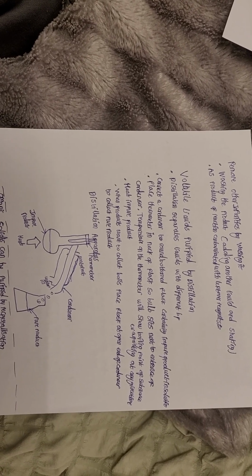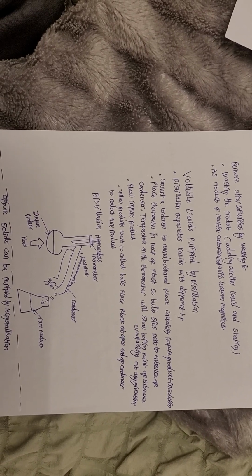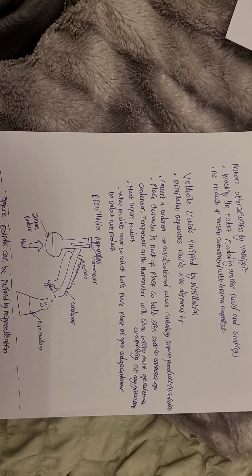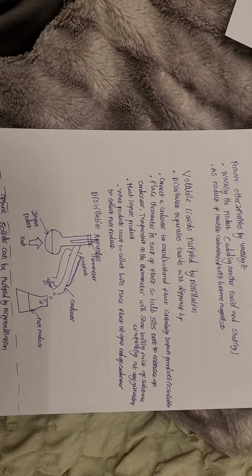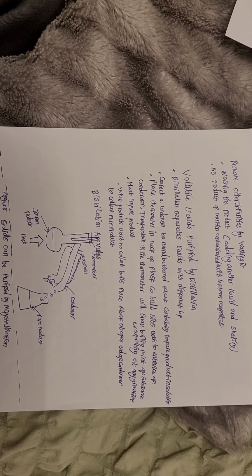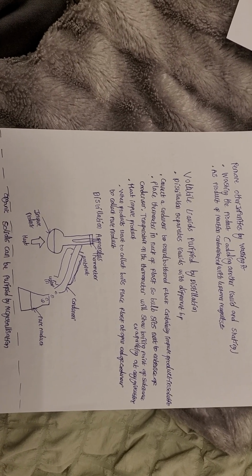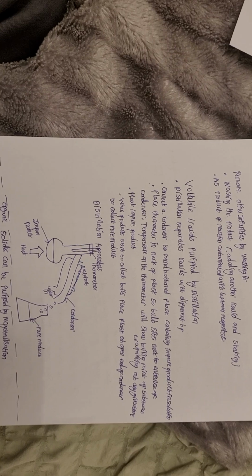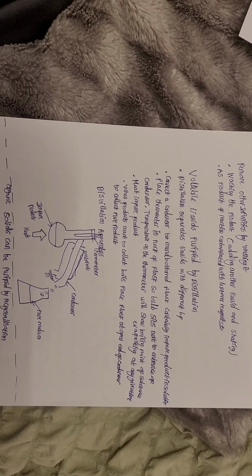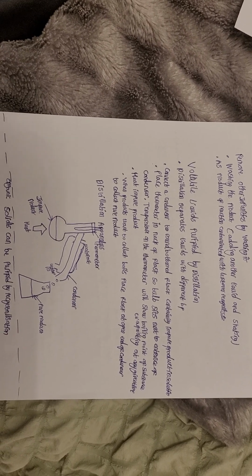This is a really key thing. The temperature on the thermometer will show the boiling point of any substance evaporating at any given time. You want to heat the impure product, and when the product you want to collect boils, you want to place a flask at the open end of the condenser to collect the pure product. And this is the distillation apparatus to purify volatile liquids. So you have the thermometer, water out, water in, condenser, impure product, heat, and the pure product.